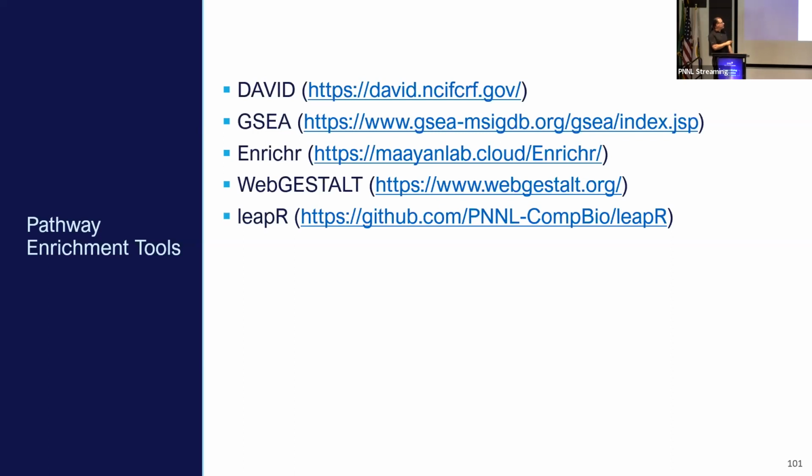So I don't want to say that ours is the only one by any means. It does fairly simple kinds of comparisons, but it incorporates those different kinds of enrichment that you can do all in one place. It's also targeted at multi-omic data integration. So for the multi-omic kinds of talks that you'll hear tomorrow, this is a tool that we're specifically trying to design to be better able to incorporate multi-omic data.